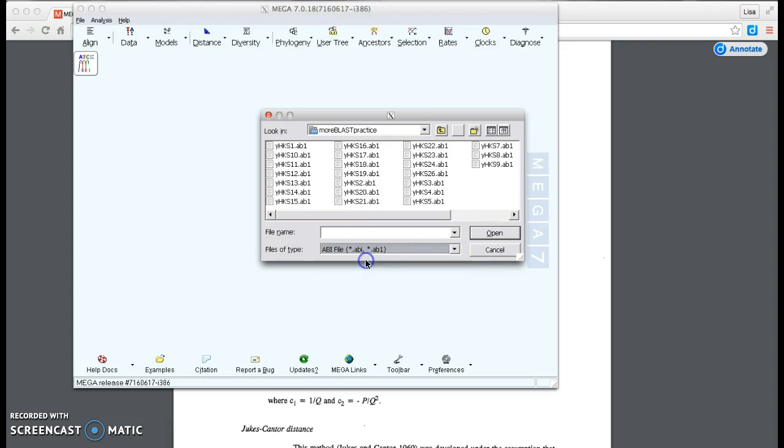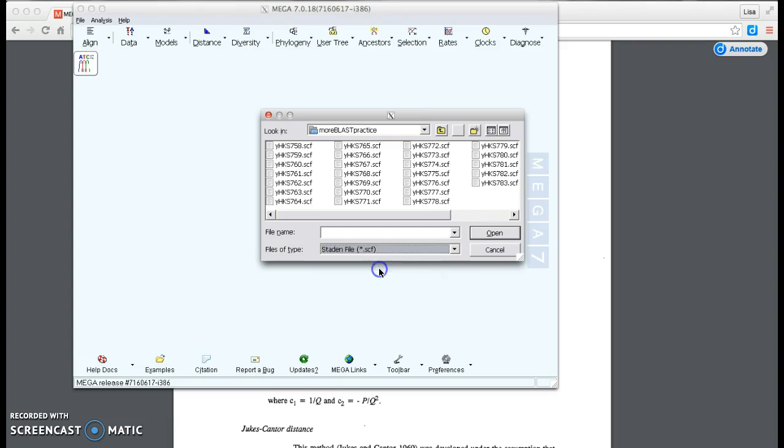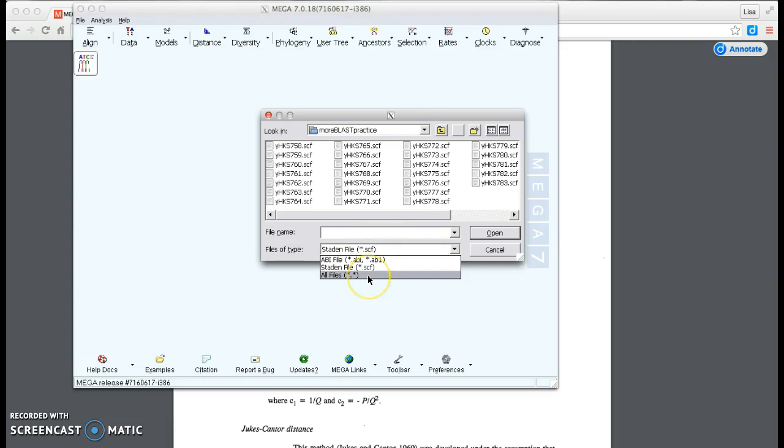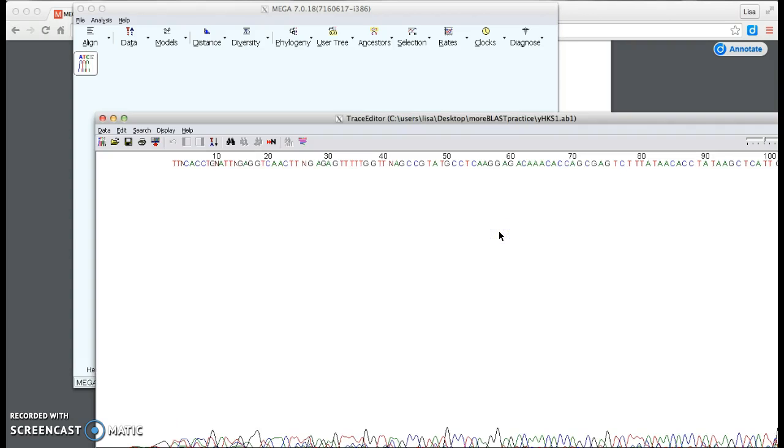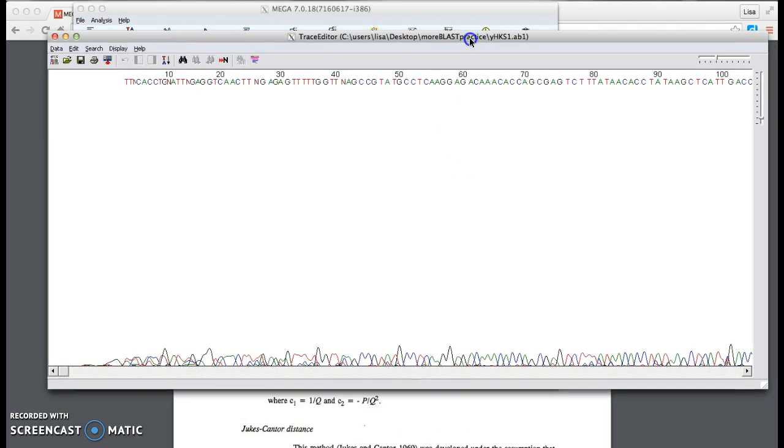If I choose the .abi, I see some. If I do the state and file, I see others. So I generally like to have it defaulted to all files. Otherwise sometimes I'm looking for something and I think I don't have it and it's really there. So I selected YHKS1. I'm opening it and then I get a window that pops up in front of the main screen.